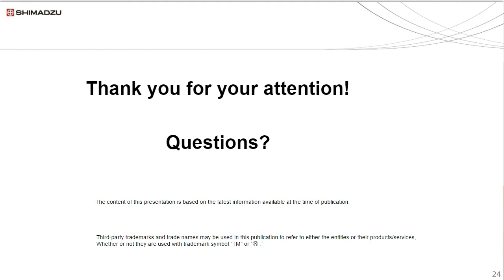Using a reaction cell is very handy, in particular with elements like phosphorus or sulfur. You can react the sulfur with oxygen, for example, and change mass to charge ratio from 32 to 48, or you can change phosphorus into PO plus, so mass to charge ratio 47, and measure that. And the reason for that is because phosphorus has a very high ionization energy, and so not much of it is converted into an ion.